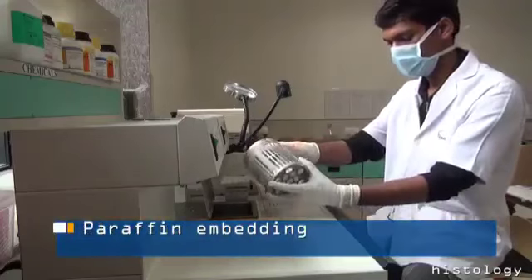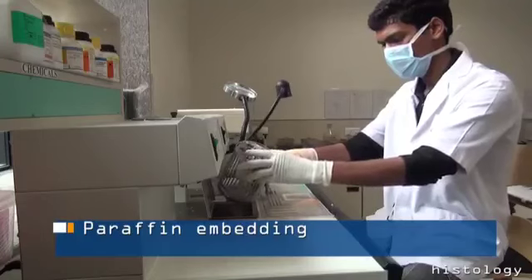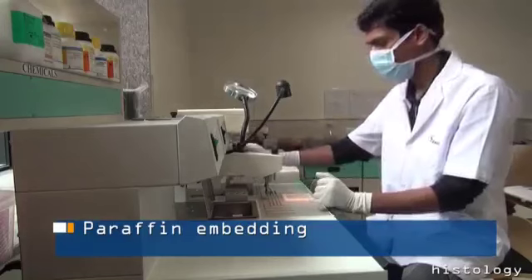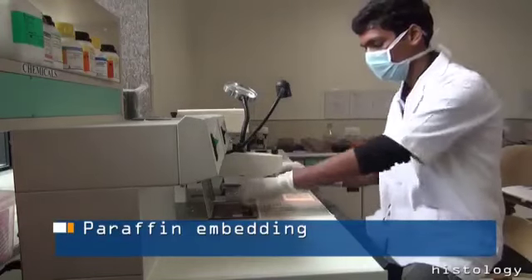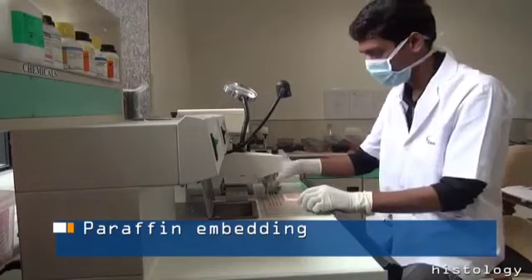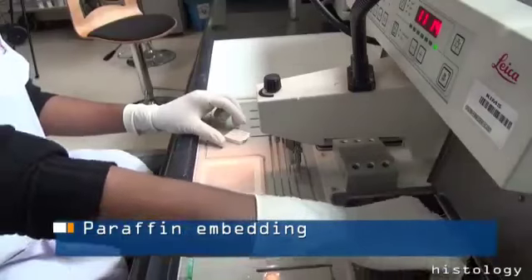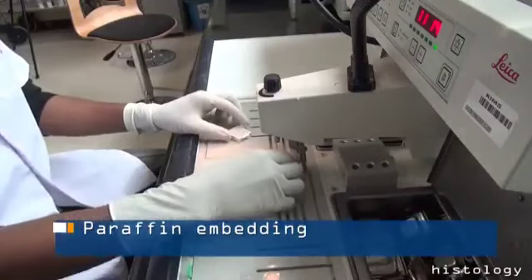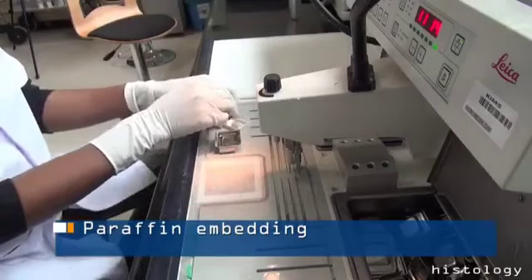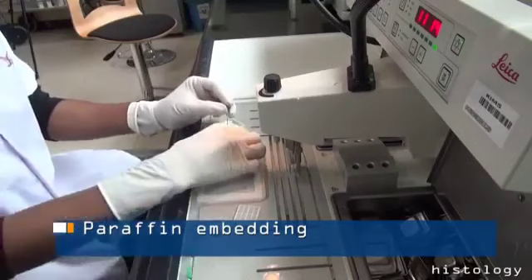Paraffin embedding. Tissues from the processor are in molten paraffin and are still in the cassettes, then transferred manually into the embedding molds. Tissues must be aligned properly at the bottom of the mold, and the bottom part of the cassette containing the accession number needs to be placed over the mold. The mold and cassette are then filled with more molten wax. The paraffin is then allowed to solidify by putting the embedding molds on a refrigerated surface.